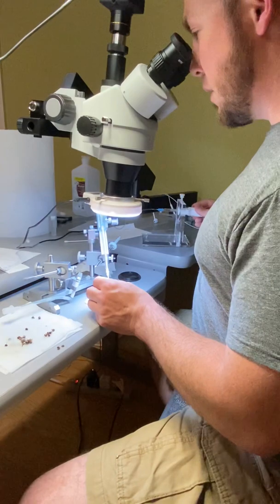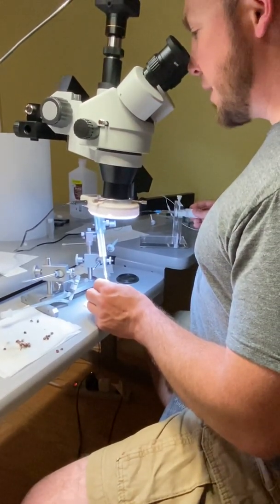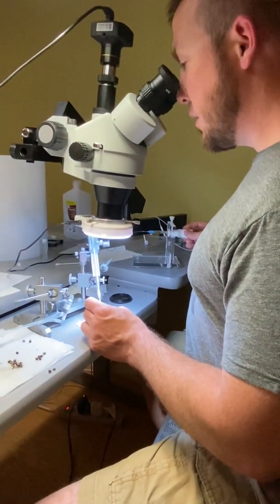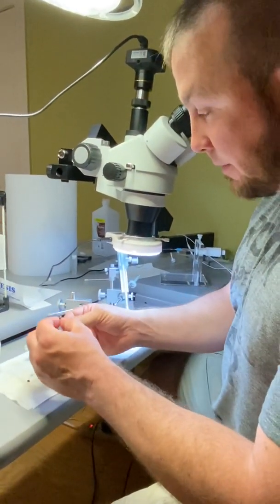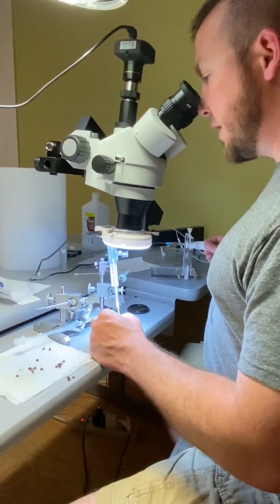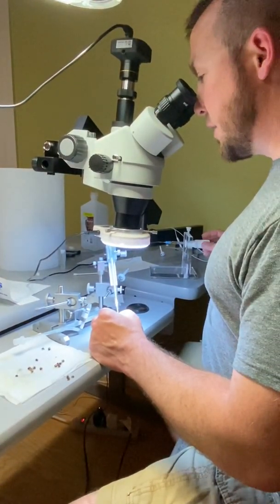How long does it take to fill up your tube? I may not be the fastest, but I'd say a couple hours. I wouldn't be surprised if I sat here for four hours at a time sometimes. If I sit here for four hours I'll have more than one tube — a tube is like a hundred microliters, which is enough to do ten queens.